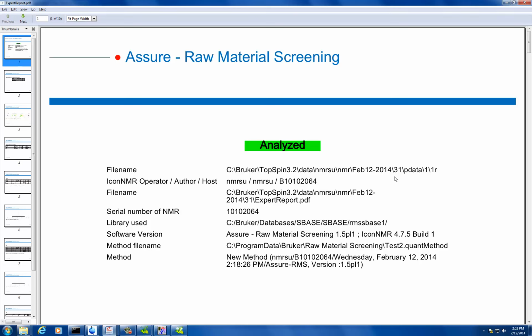You can definitely purchase one as well, but they're expensive, so you can just make it on your own. To flame seal, we use a special Bunsen burner. We burn the top to melt the glass. That one is in DMSO and this is in D2O, so it really doesn't matter what solvent you use. Whether D2O or DMSO, the correlation of the information is still the same.